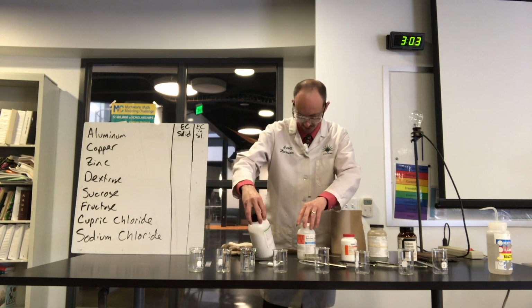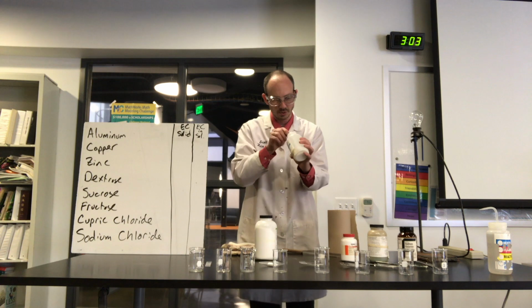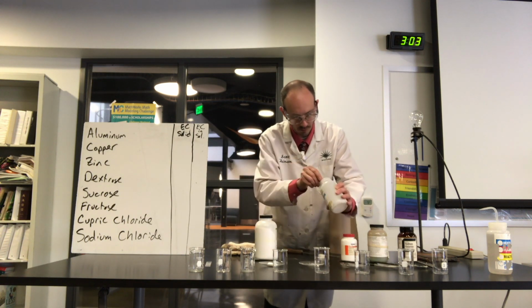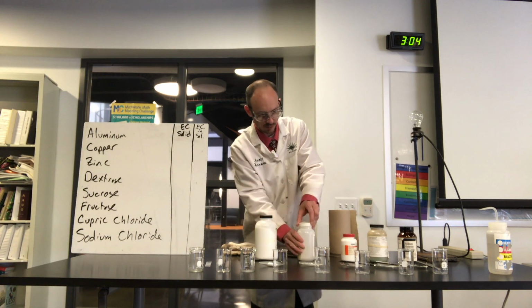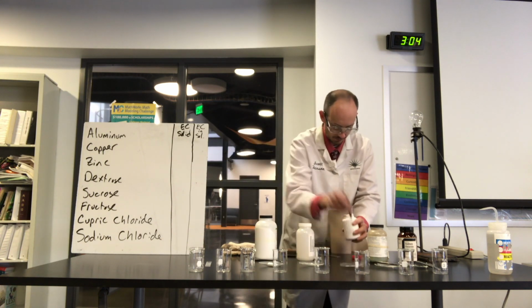So, this is the dextrose. This one is my sucrose. Okay. And then my fructose.